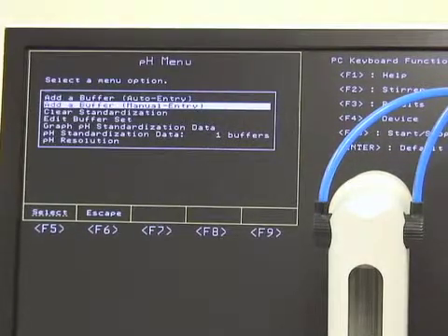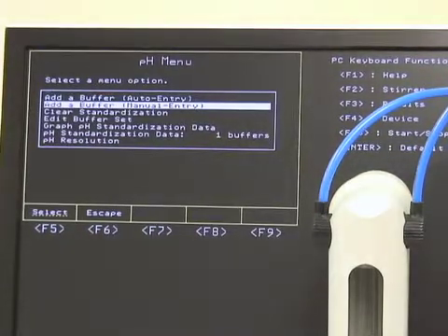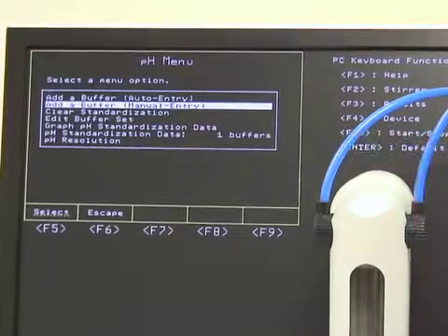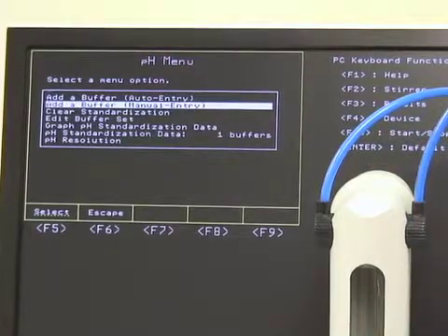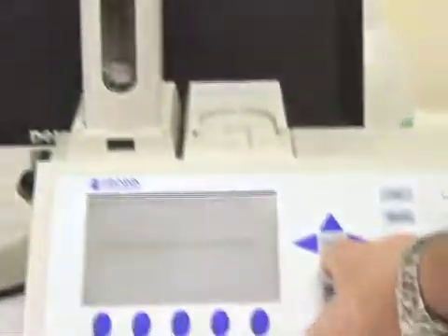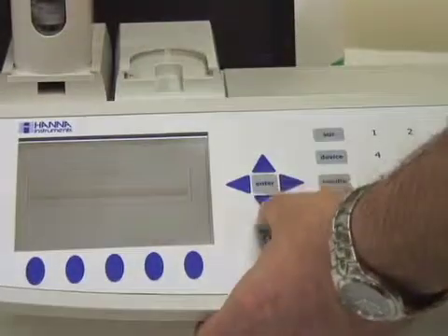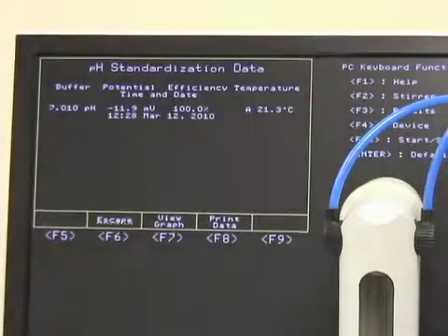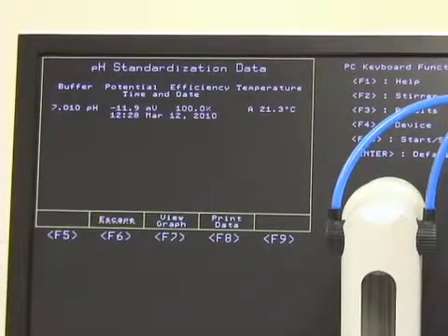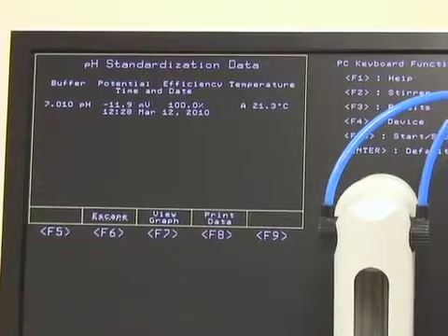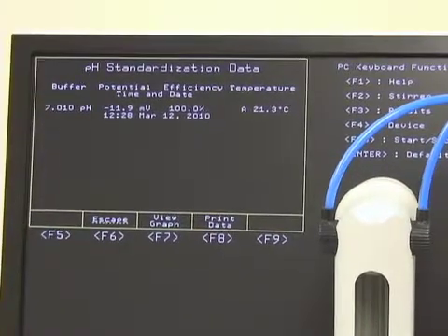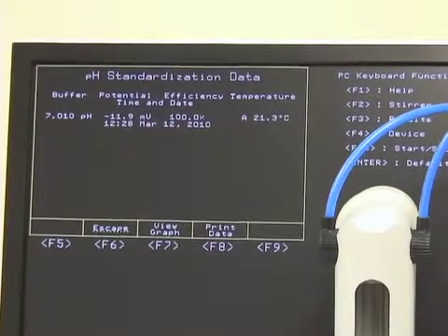There we go. You can now see under pH standardization data: one buffer. Scrolling down to that — we did a 7.01 pH buffer, it came in at 100%, and it was done March 12, 2010.